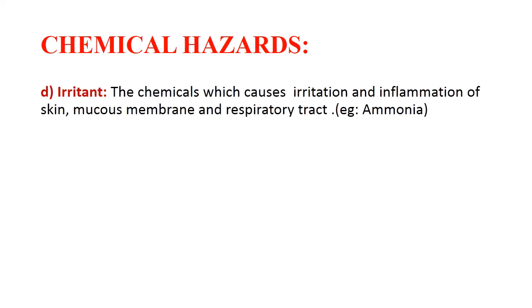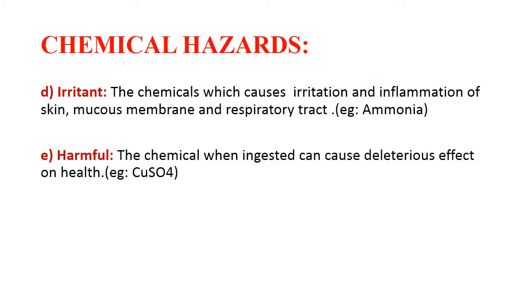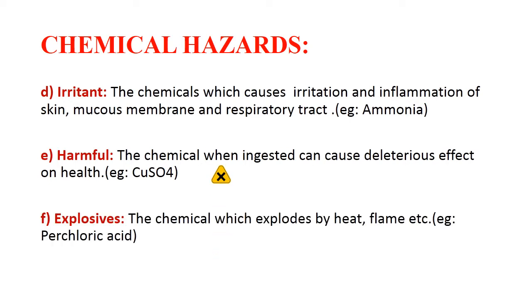Other types of chemical hazard include irritant — a chemical that causes irritation and inflammation of the skin, mucous membrane, and respiratory tract mucosa if inhaled; example: ammonia vapor. Harmful — a chemical that when ingested can cause deleterious effects on health; example: copper sulfate or blue vitriol. This is the logo for harmful substances.